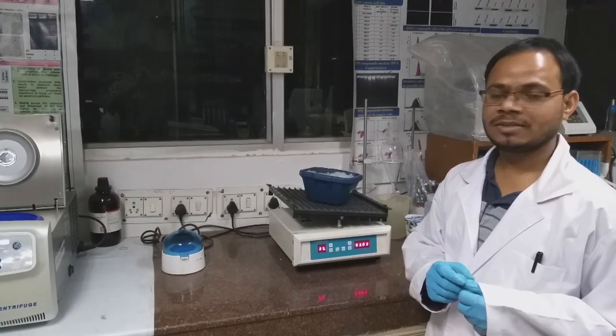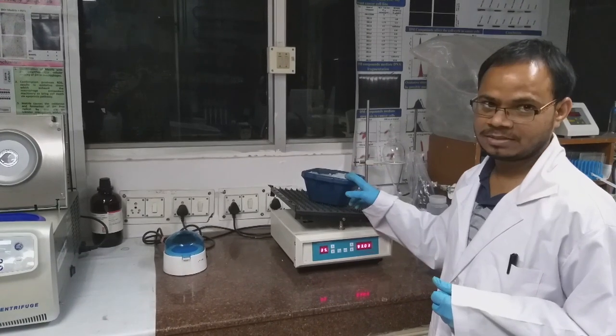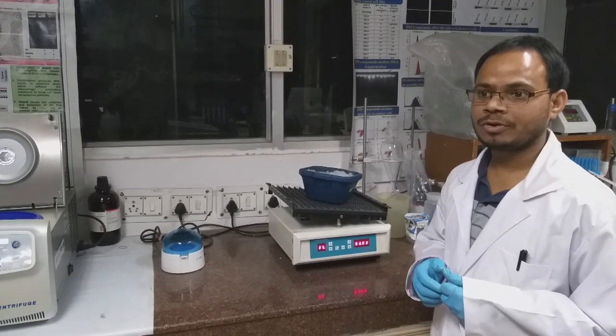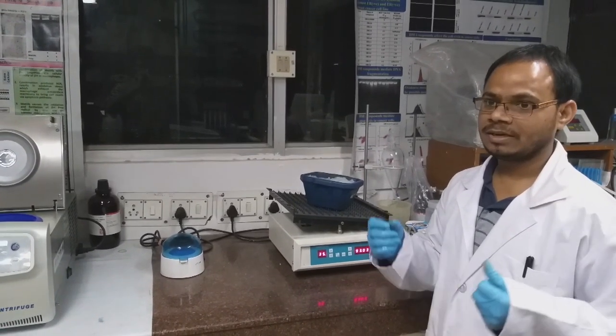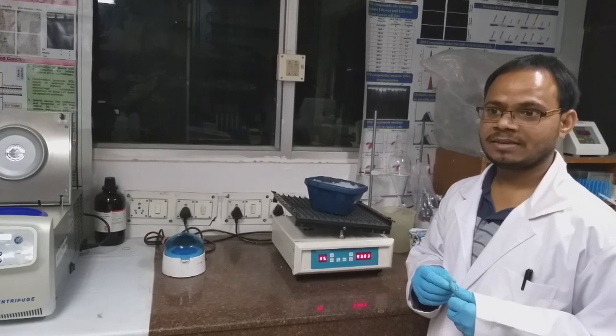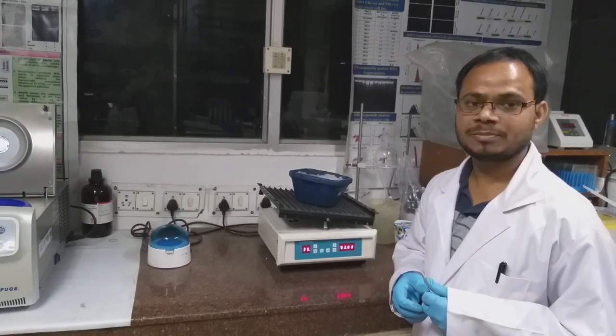So once column packing is over, we kept it in ice and we'll keep in this condition for at least 2 hours for binding. So that His-tagged protein will bind to the nickel NTA, and in further steps we will elute the protein.